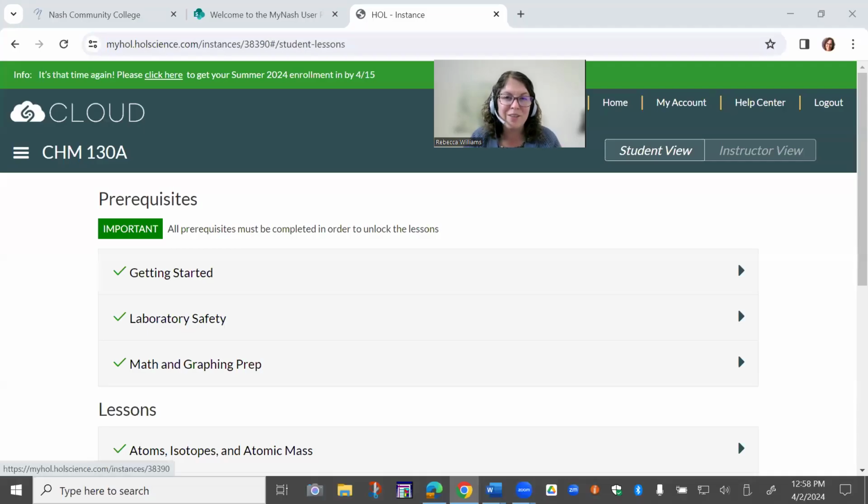Hey students, putting together a quick video to show you how to do the Getting Started lab with Science Interactive. You should have a link that's going to bring you to this hands-on lab platform. This is your dashboard.